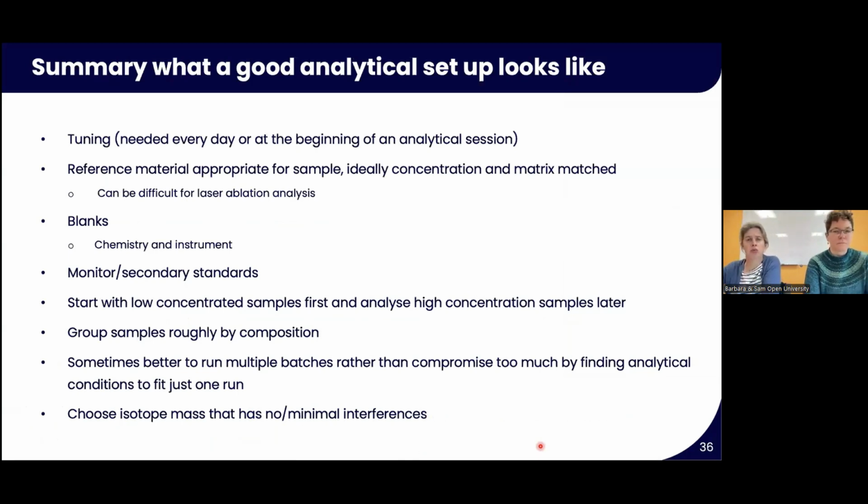So just to summarize really what a good analytical setup looks like. You should be doing tuning every day at the beginning of your analytical sessions. You should be running reference materials that are appropriate for your samples, ideally concentration and matrix matched, although this, as we've said, can be difficult for laser ablation analyses, and there are ways to try and overcome this.